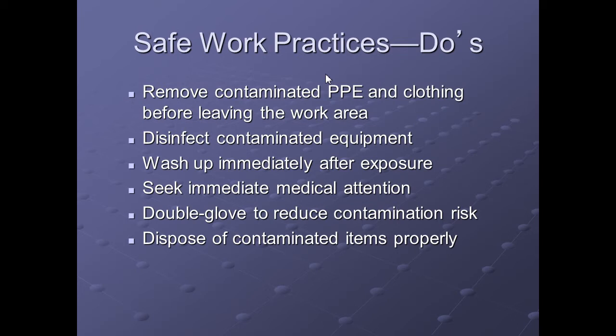PPE, disinfection of any contaminated equipment or shelves in your lab. Wash up immediately after exposure, and that's you washing yourself, your hands, immediately after exposure. And if there's any splash on your clothes or in your face, you're going to have to wash your face up real quick too. Double glove to reduce contamination risk. That's a good one. And dispose of contaminated items properly.